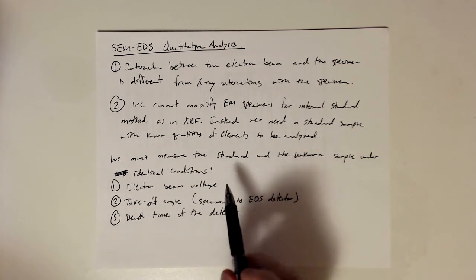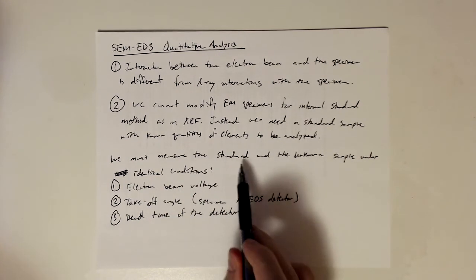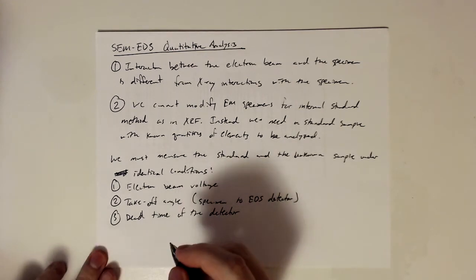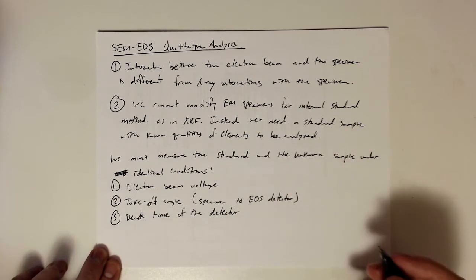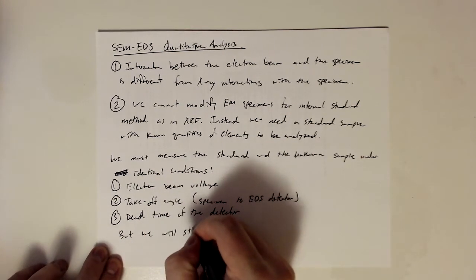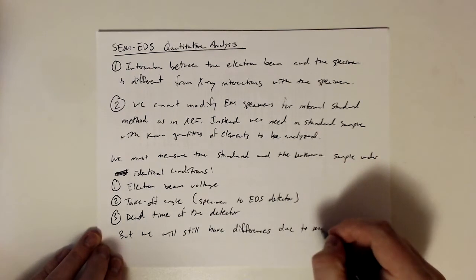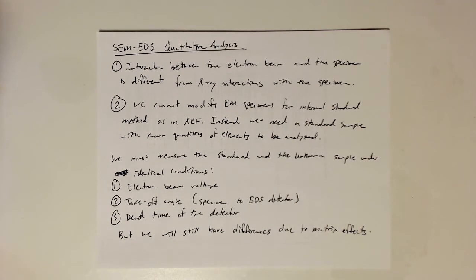If you think about it from the point of view of XRF, this was all instrument factors. Since we're using two separate specimens, we have to keep our instrument the same in both conditions. But we still have those matrix effects that were part of the specimen, and so those can still be differences. So the matrix effects, we'll still have to examine those.